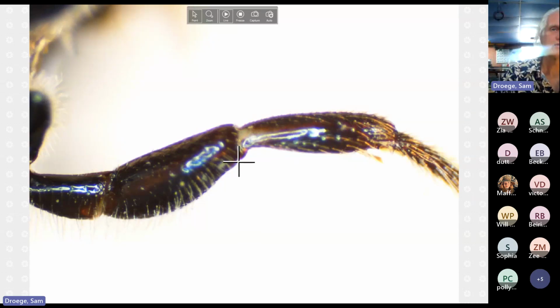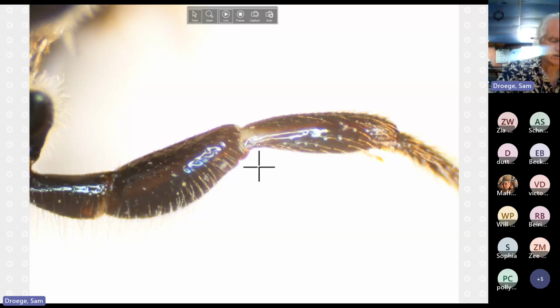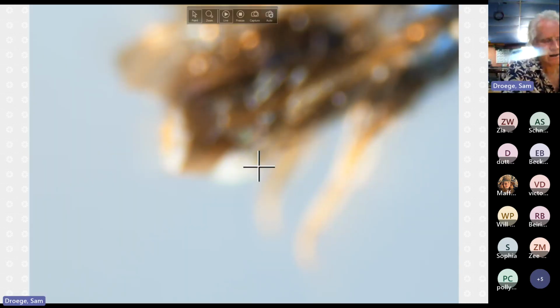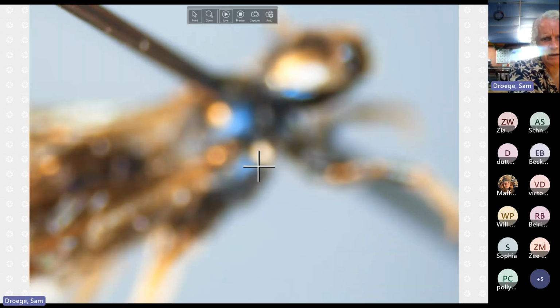You're right. And the stripe is just not as clear. So the stripe goes to about there, but it's not as big and wide. So I'm going to take your suggestion, Claire, get rid of the label on this, which is whitey white. See if we can find our bad boy, girl, rather, in here again.